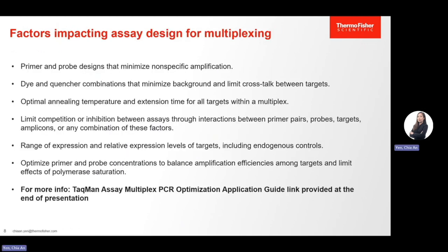So designing an assay for multiplexing is like solving a complex puzzle where numerous factors can impact the reliability of your results. One of which is nonspecific amplification in your no template control reaction.